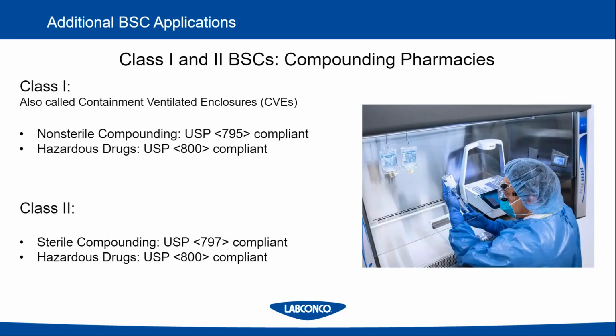Class 2 biosafety cabinets are used with sterile compounding. So the best example probably is chemotherapy. You think of a cancer patient who probably has a very compromised immune system from either the cancer itself or from chemotherapy. Chemotherapy drugs are very hazardous, especially in highly concentrated forms.